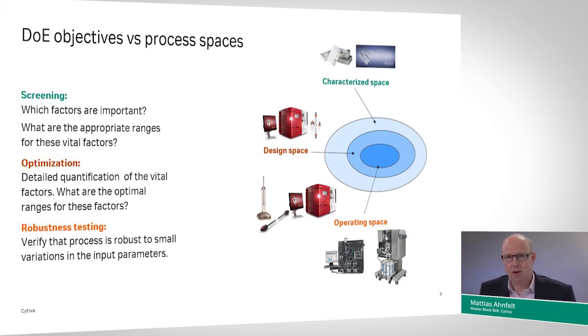Also a comment about screening and early stages of process development. Since the availability of the HTPD formats, like multi-well plates or these super small columns, a lot of the downstream screening can be performed in those formats, which really helps the bigger column format investigations to quickly move into the second objective instead, which is optimization.